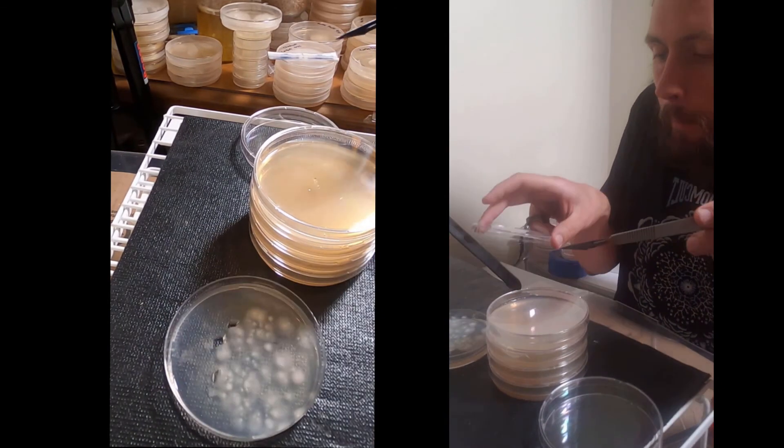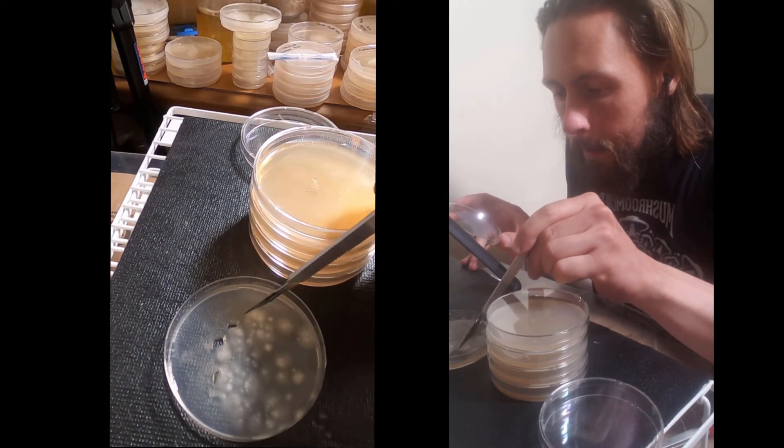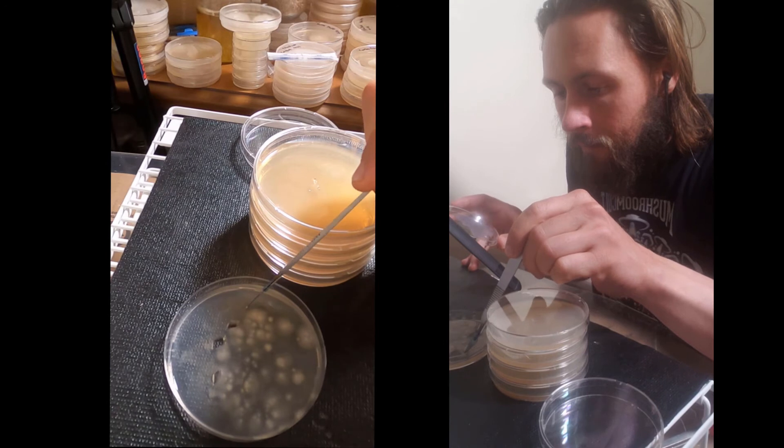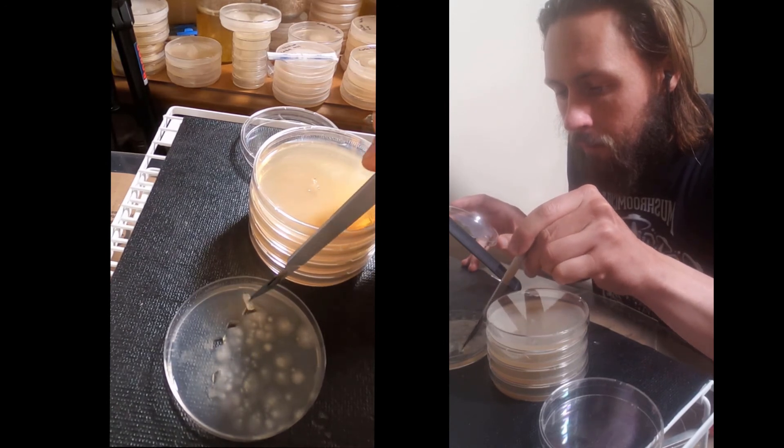As I lift the lid I'll be looking for an easily accessed leading edge of mycelium — that one looked like it was the easiest one to access. So I'm just pulling up a small piece.